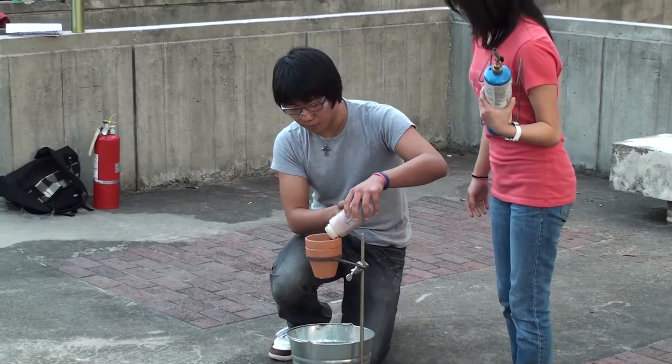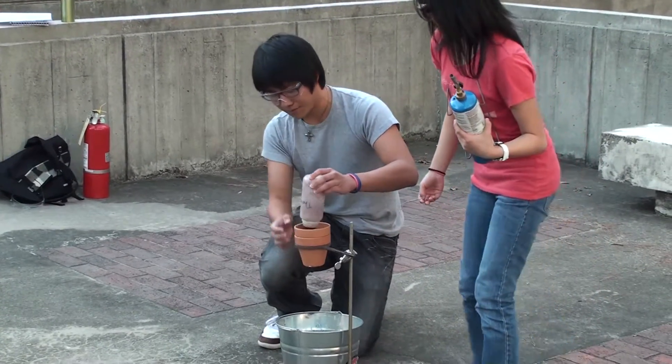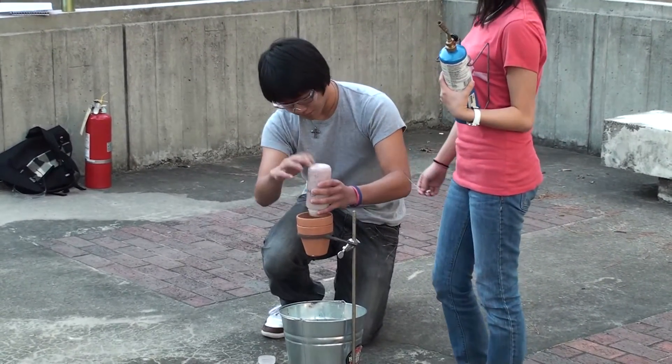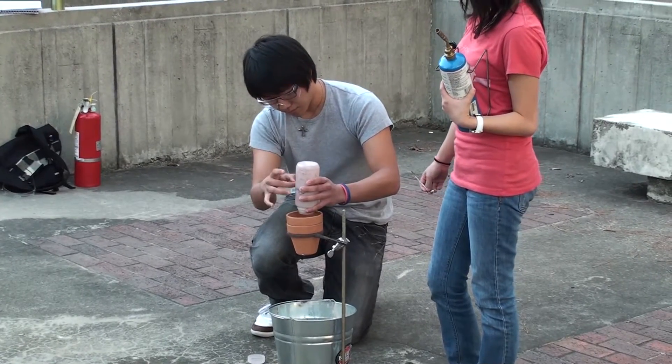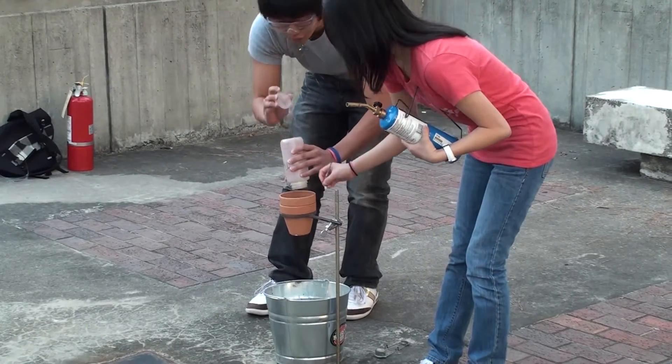So we're going to pour the mixture into the flower pot. It's stacked two layers, so it's actually pretty thick. Make sure we got everything.